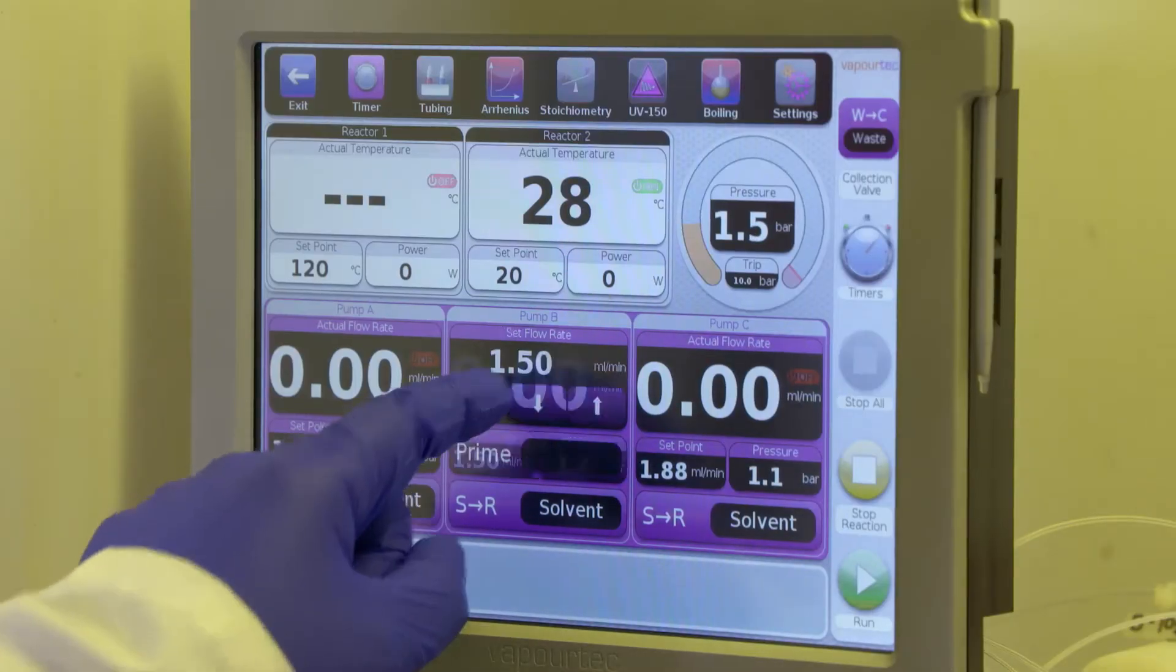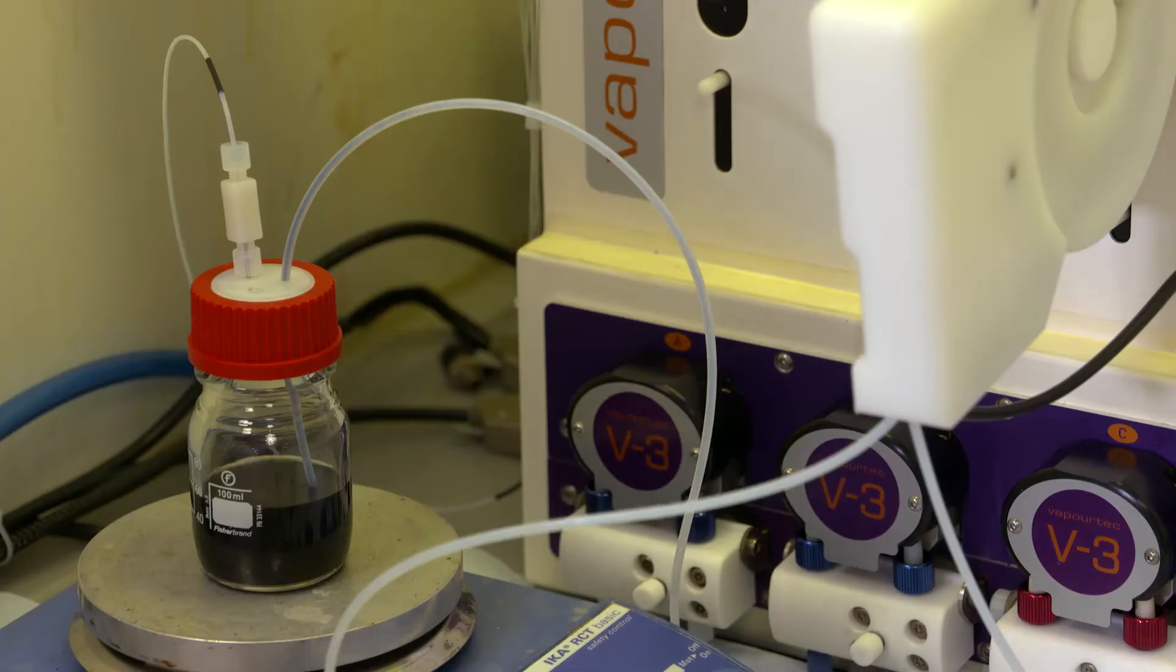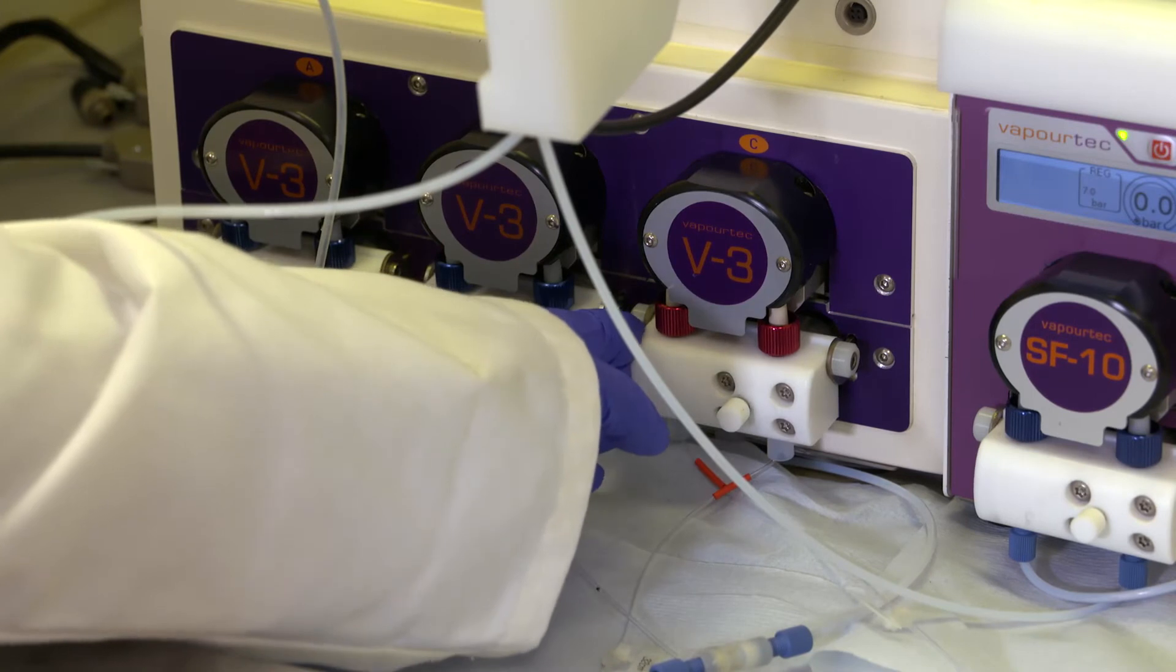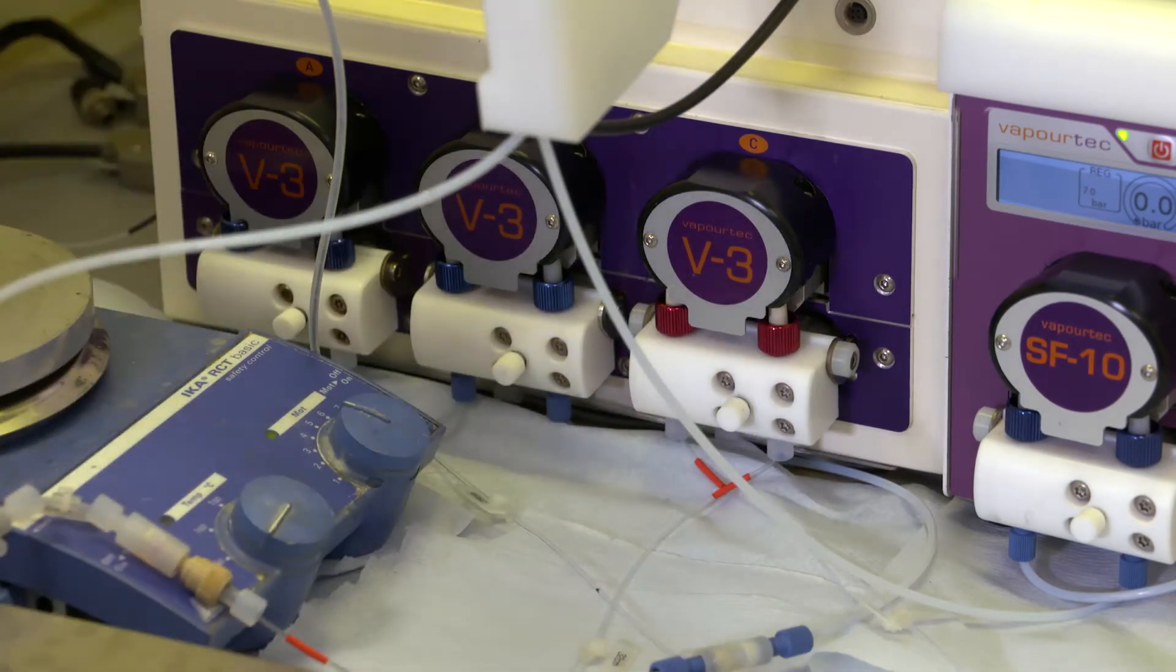Now that the reagents are ready I need to prime the slurry up to the pump. So this E-Series is equipped with special slurry manifolds and I'm using larger bore tubing for all of the flow path that the slurry is going to pass through.